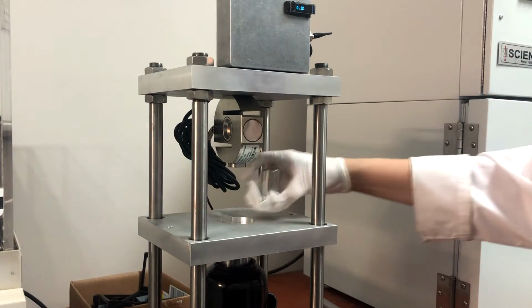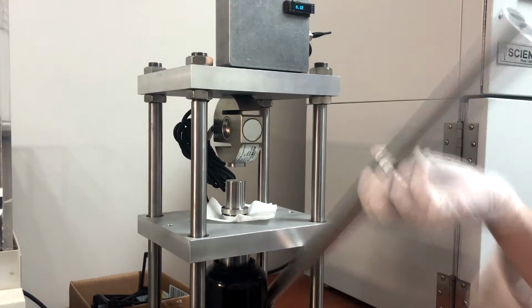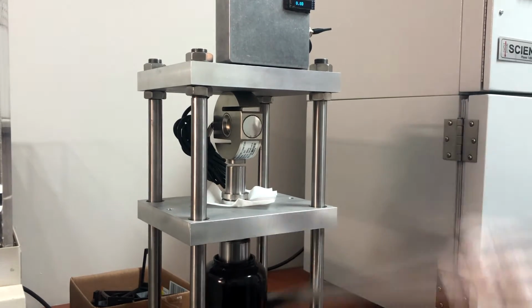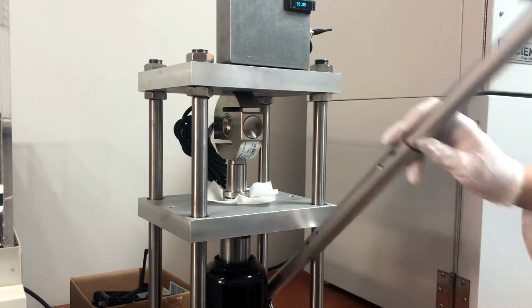Now that we have built up our sample by layers, we then go to the homemade press with a digital output. We place the die set in the designated slot and tighten the jack. The digital output hasn't been calibrated but is reproducible, so we press it to a set number.